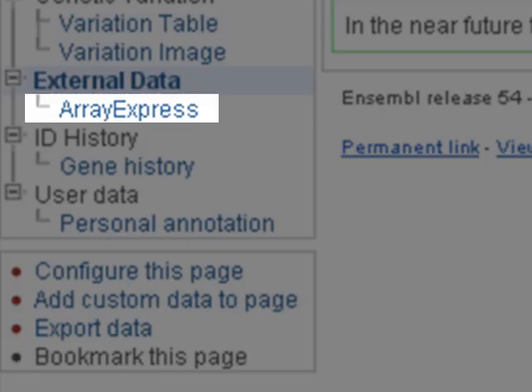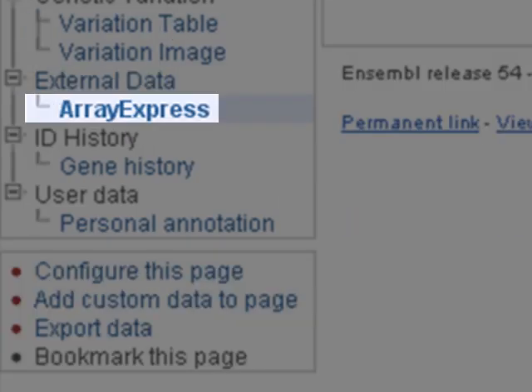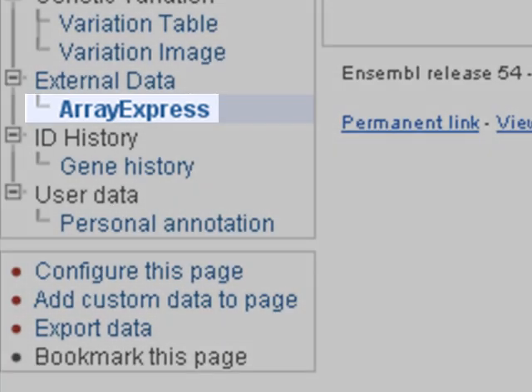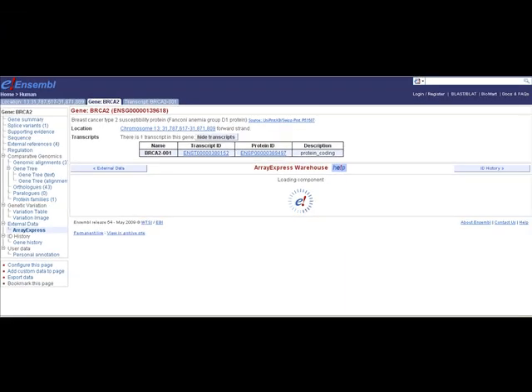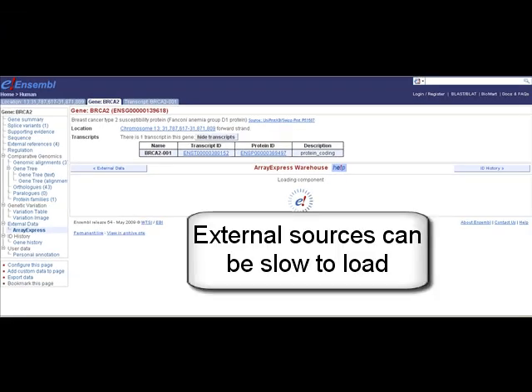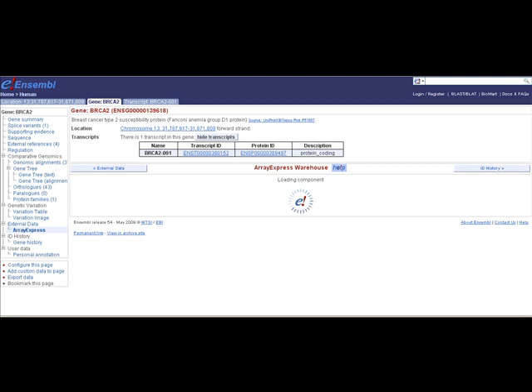Now you may see another link to ArrayExpress. Keep in mind these external sources sometimes take a while to load, because the information is not stored in Ensembl and we have to reach out externally.